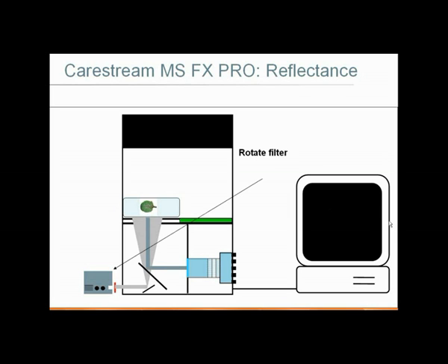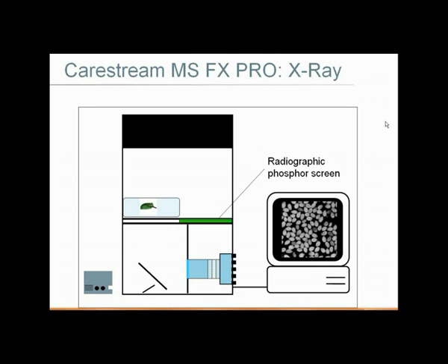It then goes through in an unfiltered image, or you can collect a red, green, blue image if you want by pre-programming the system to automatically collect red, green, and blue reflectance images and then co-register and overlay them either in the multispectral software or in ImageJ, which is available freely from the NIH. Last but certainly not least is the X-ray system.